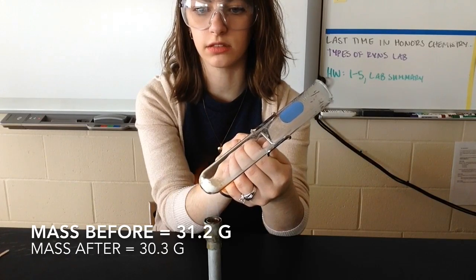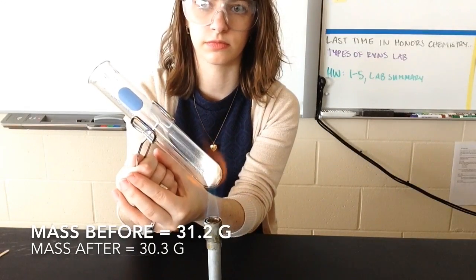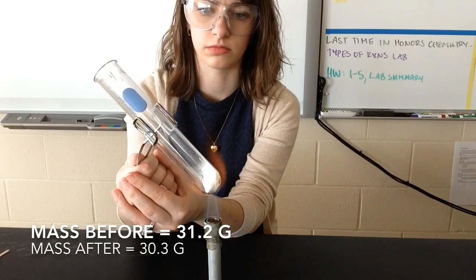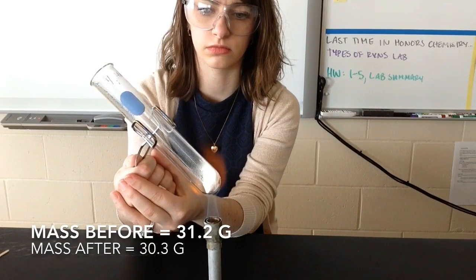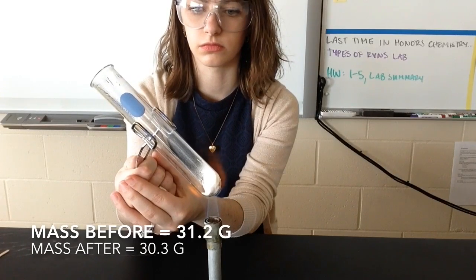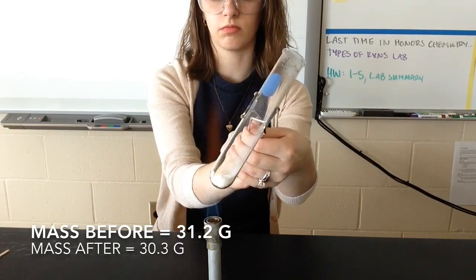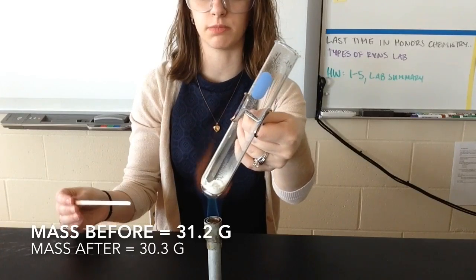So we're at about 1 minute. Okay, so I think we're at about 2 minutes, so I'm going to go ahead and do the wood splint test.